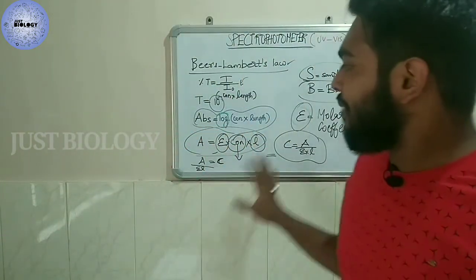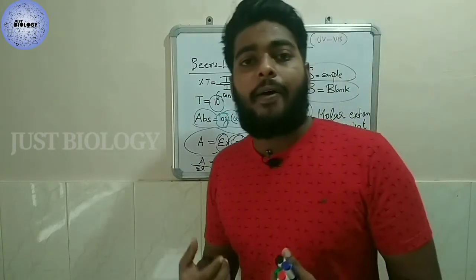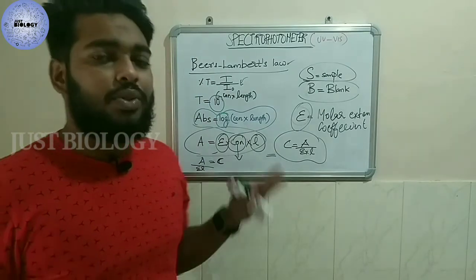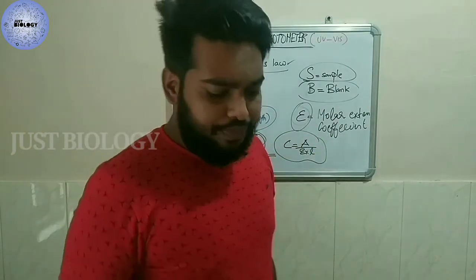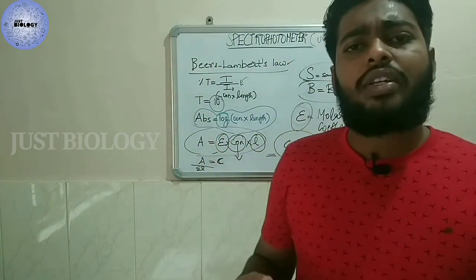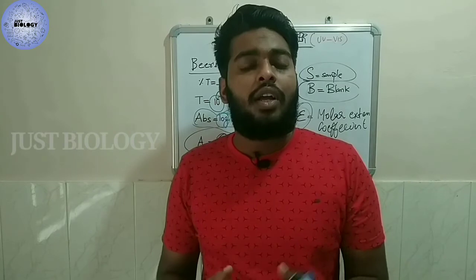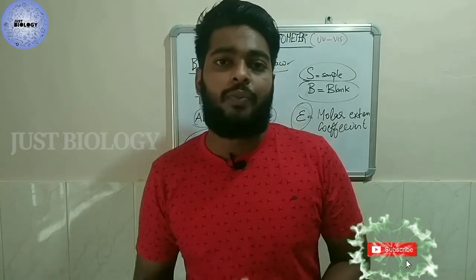This is actually the mathematical derivation of Beer-Lambert's law. This is more than enough to understand what Beer-Lambert's law states. Then apart from this, what are all the applications, the significance, and the uses of this spectrophotometer that we want to discuss now.